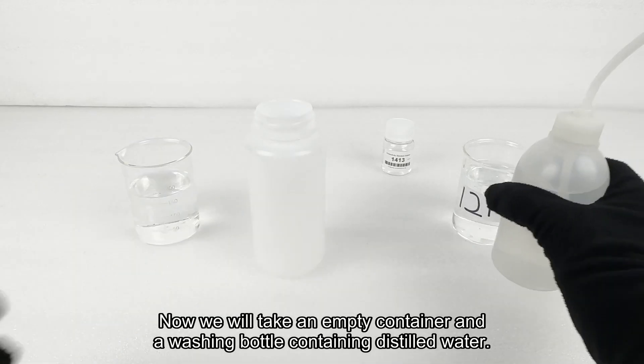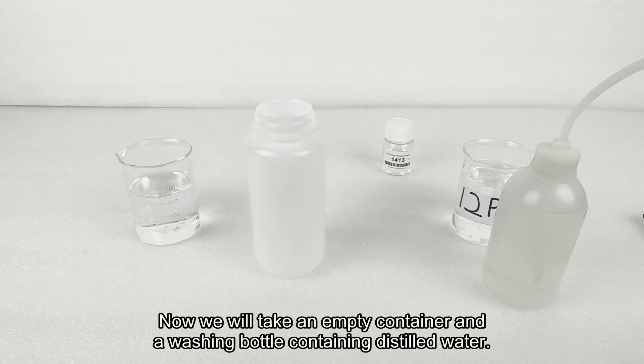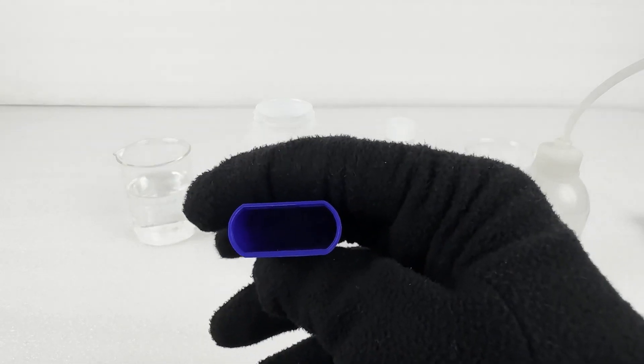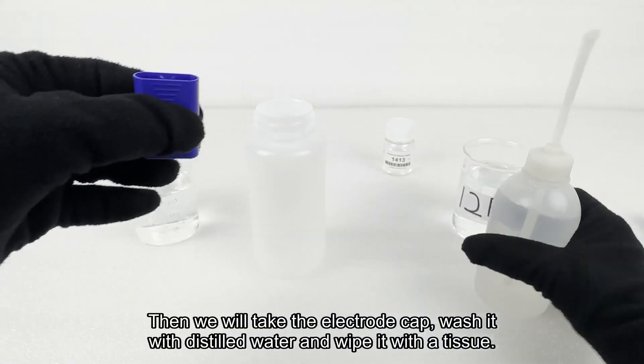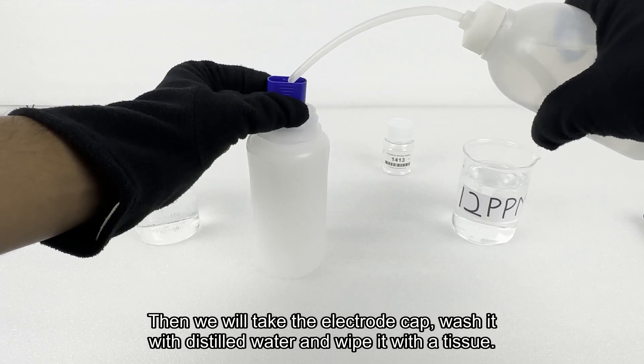Now we will take an empty container and a washing bottle containing distilled water. Then we will take the electrode cap, wash it with distilled water and wipe it with a tissue.